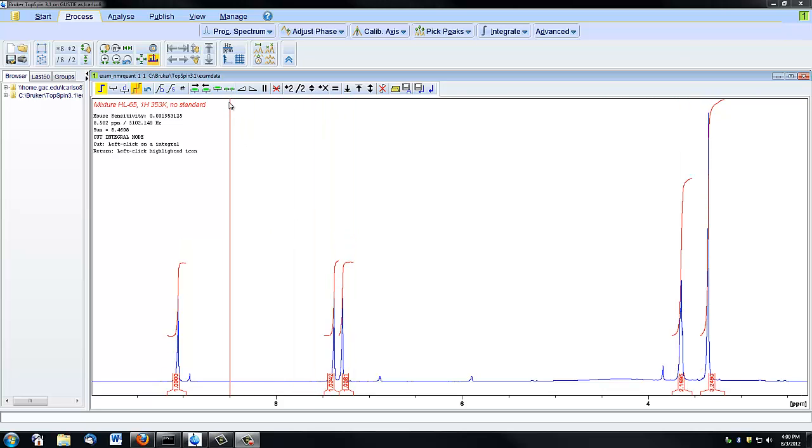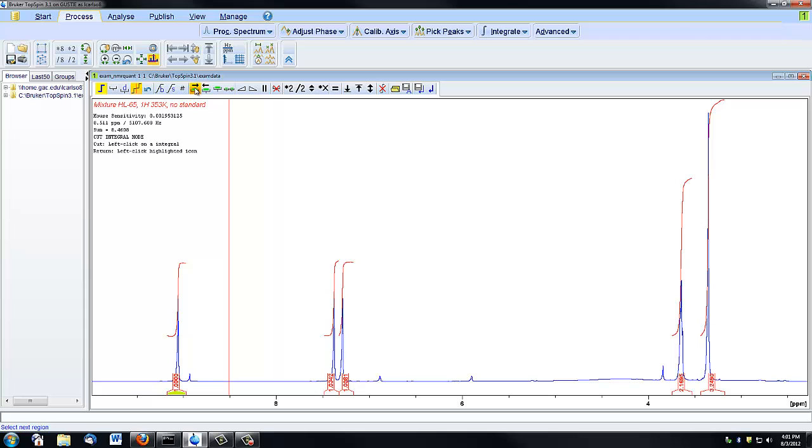You can use these green icons here to select one integral at a time. You can tell which integral is selected by looking at the green filling in the bottom of the screen.